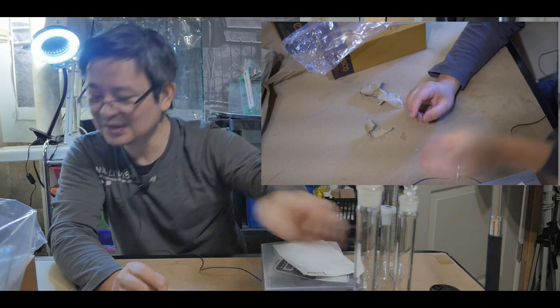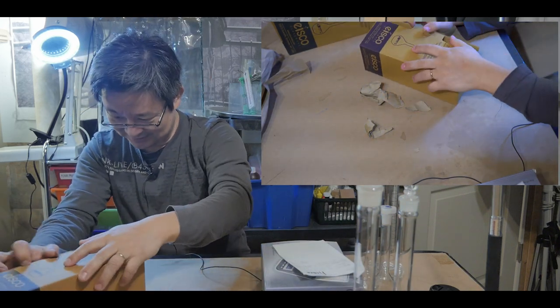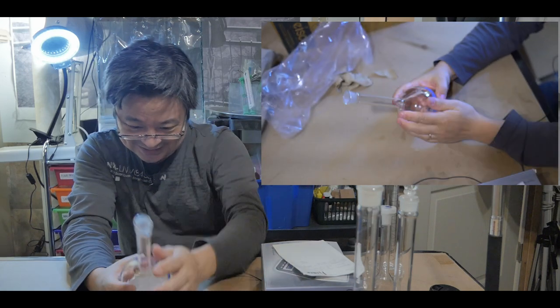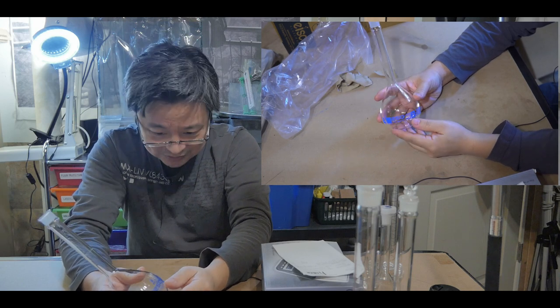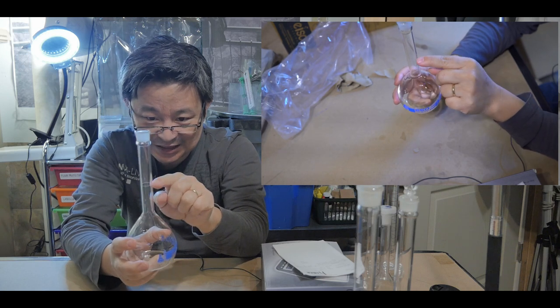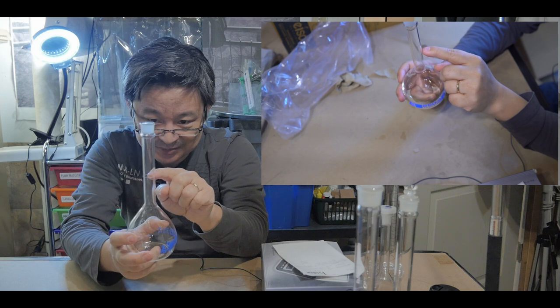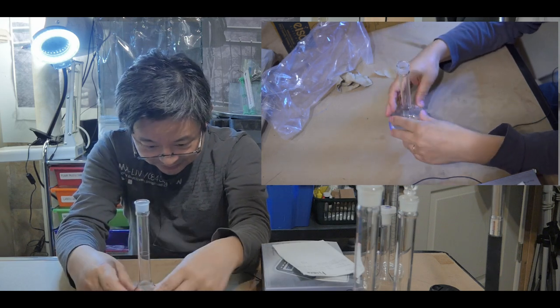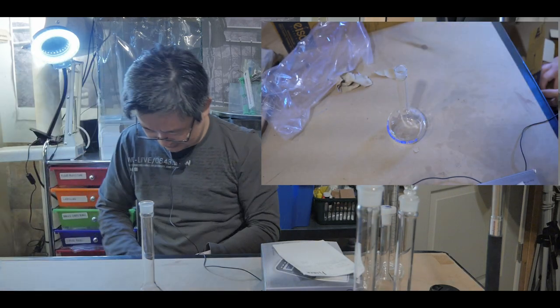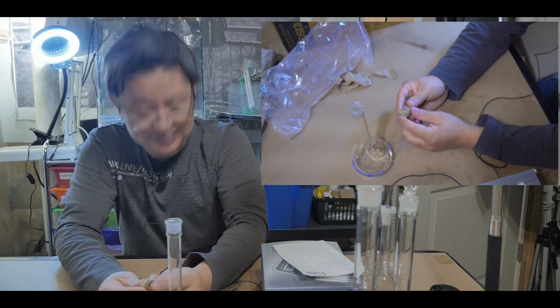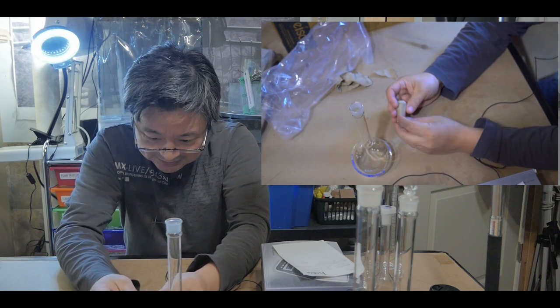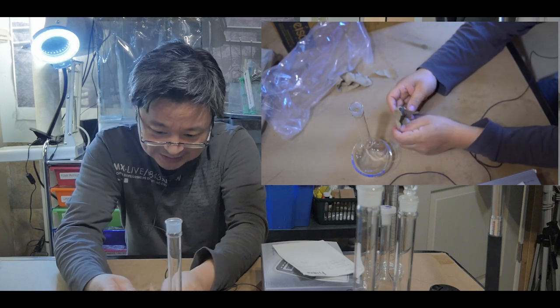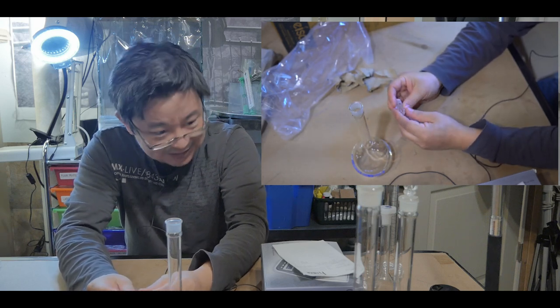Last one. Okay, let's see how this one turned out. Wow, I love it. Whoa, nice. Now, this one is 250 mils, plus or minus 0.24. Okay, so if I bring it up all the way to this line, this calibrated line, and looking at the middle of the solution in the meniscus, I'll be able to get 250 mils plus or minus 0.24. Okay, very precise. This is why I love volumetric flasks, just that precision. Okay, where's that? Did it come with it? Oh yeah, it did. Glass stopper, this one here. Okay, so let's open it up. I got these three now, I guess Class B, so it's not, you know, I don't think it's new. This doesn't look like - or at least, it's not, it's new, but it's not the best quality.